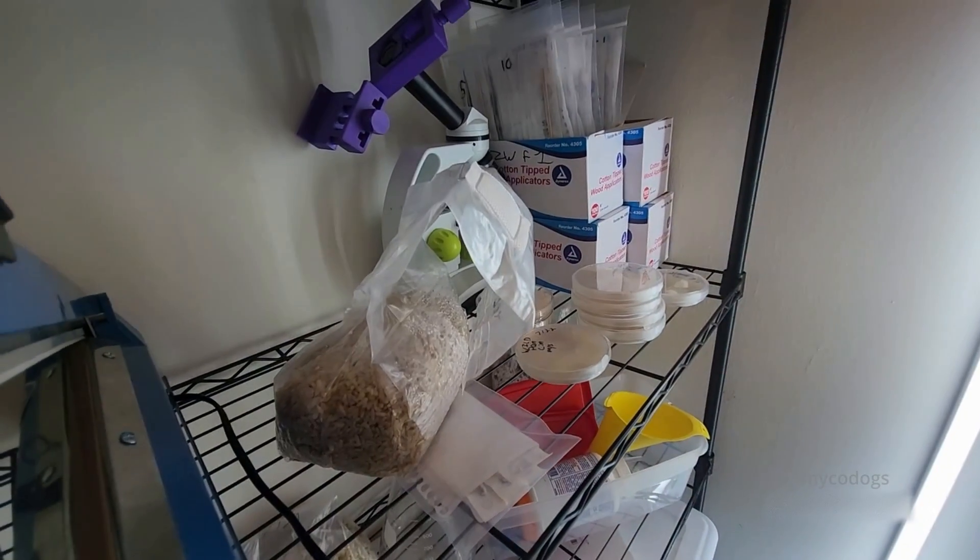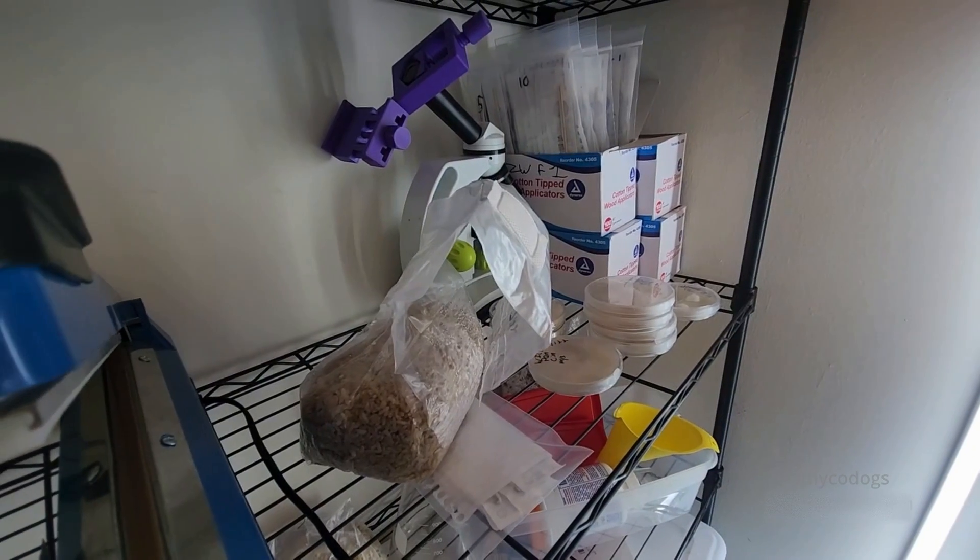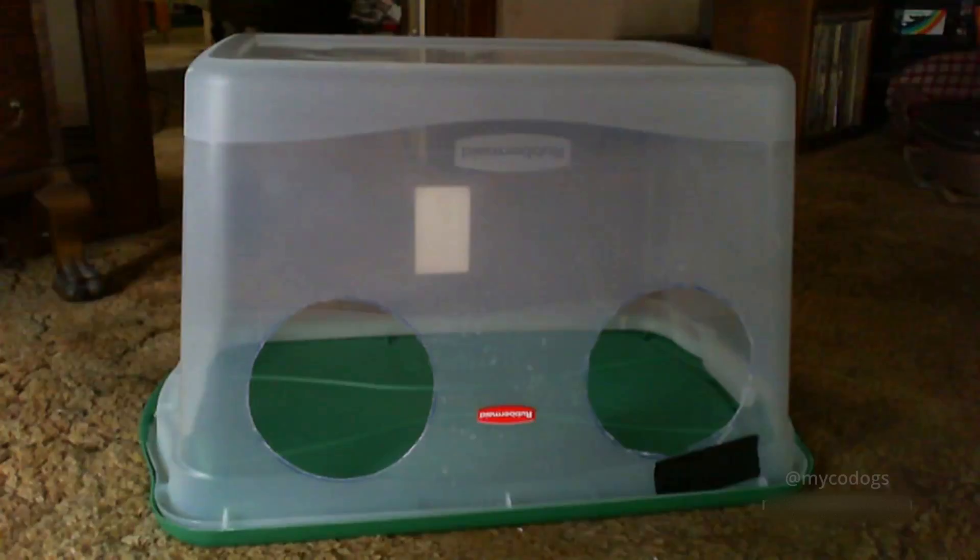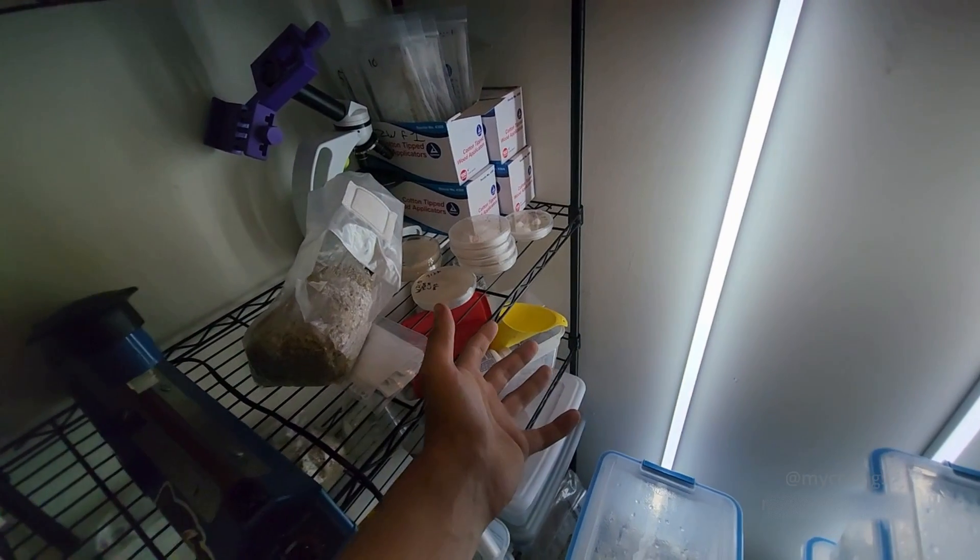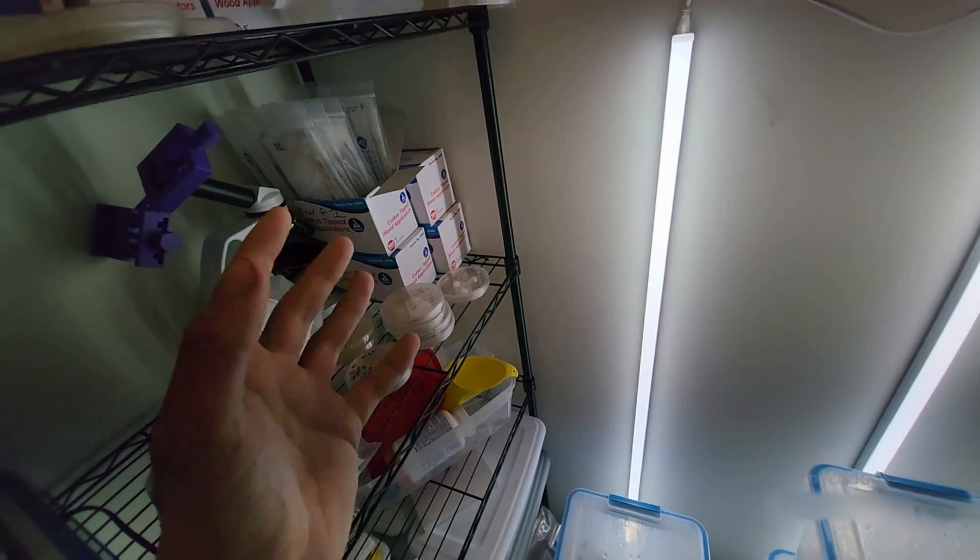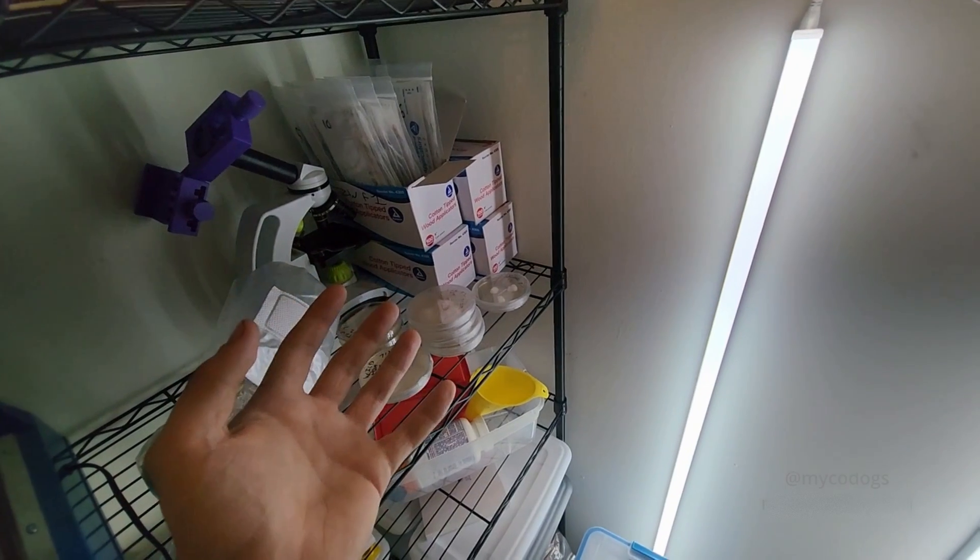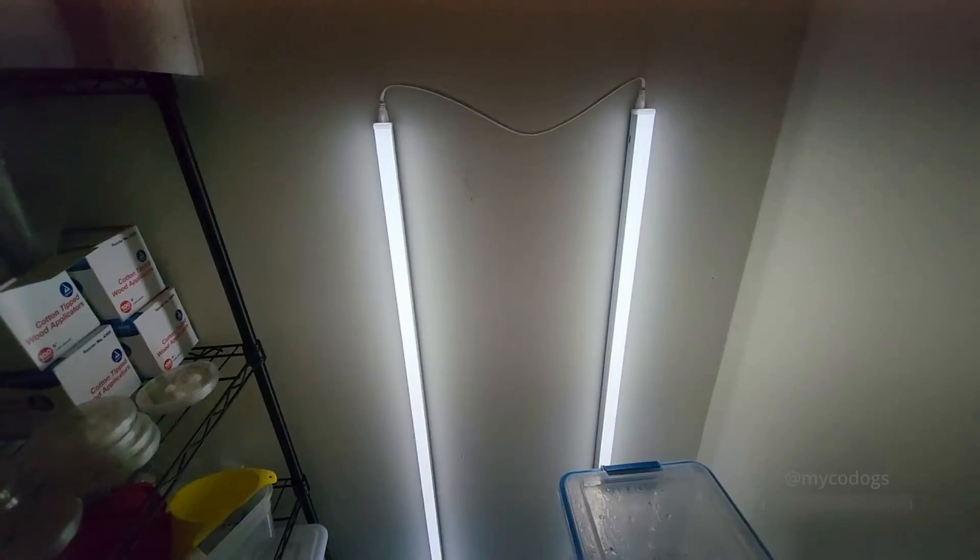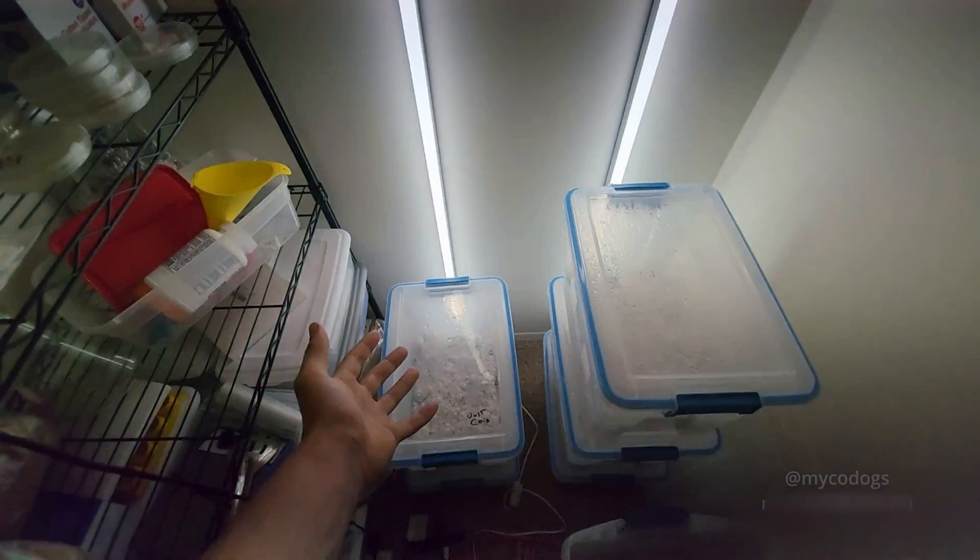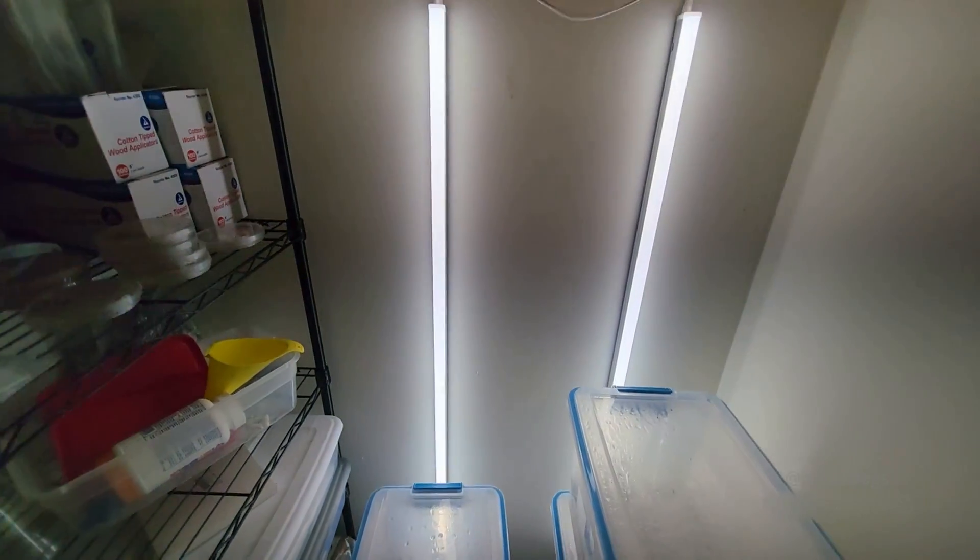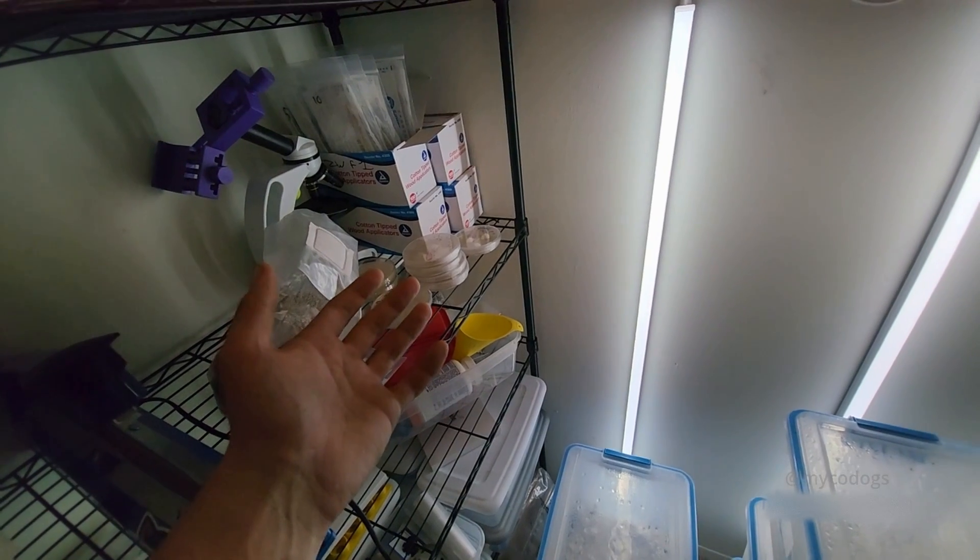They operate in two different manners to achieve sterility. The fan filter unit cleans the air, and the still air box allows the particles to settle out of the air. If you are producing a substantial volume, a flow hood or a fan filter unit will make your workflow faster and more efficient, and the costs can be justified. If you are a home grower like me, who only has a couple mono tubs growing at any one time, a still air box is more than sufficient.